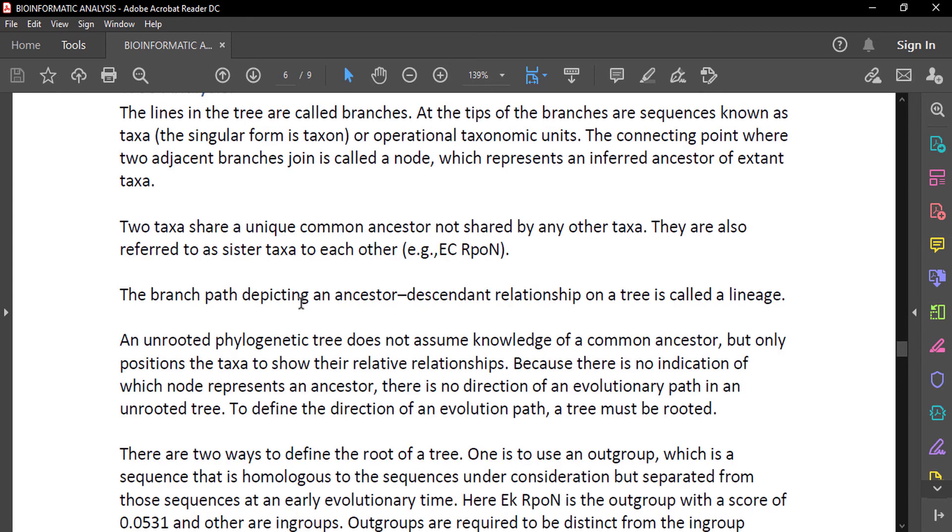This was an unrooted phylogenetic tree. An unrooted phylogenetic tree does not assume knowledge of a common ancestor but only positions the taxa to show their relative relationship. Because there was no indication of which node represented an ancestor, there is no direction of an evolutionary path in an unrooted tree.